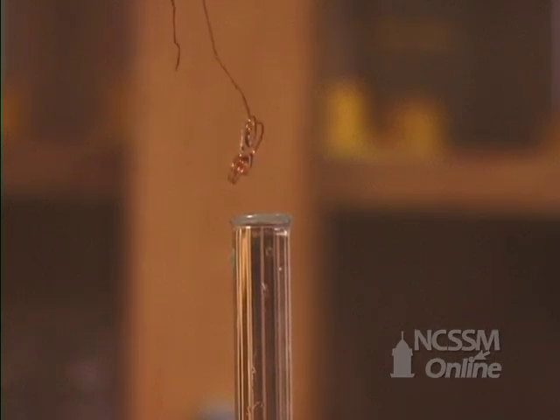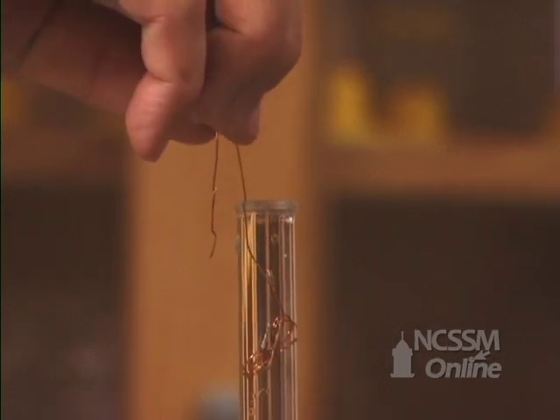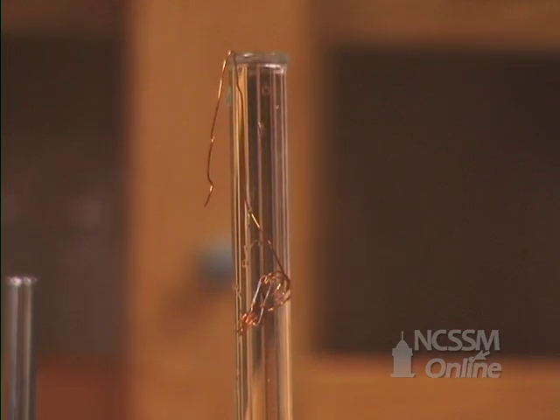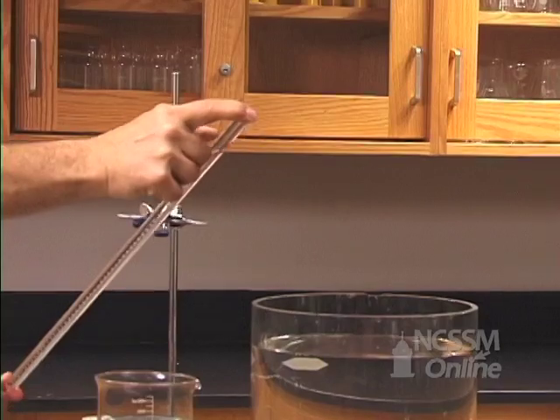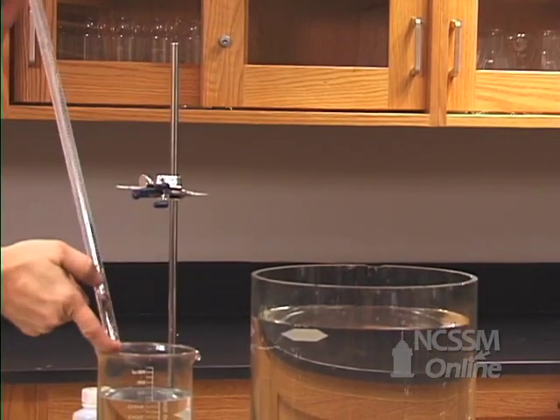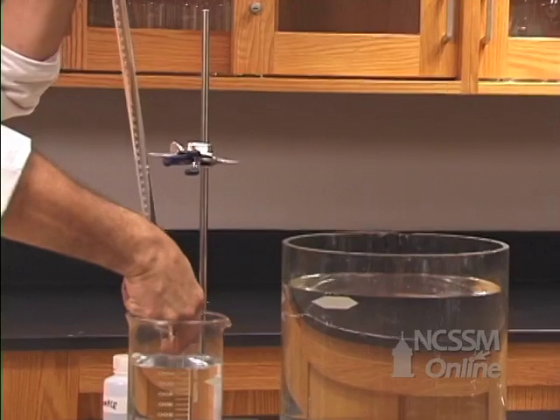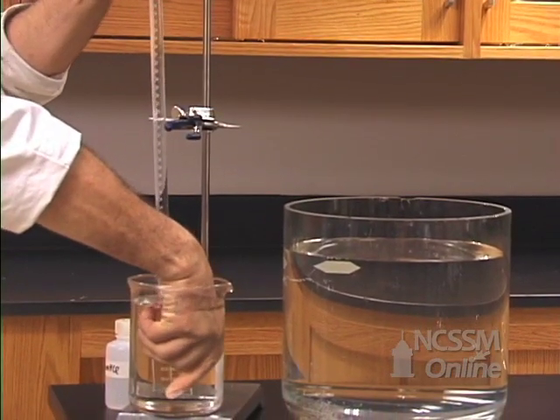We will now place the magnesium ribbon in the solution held in place by the copper wire. We will place our finger over the mouth of the gas collection tube. We will invert the tube into a large beaker of water.